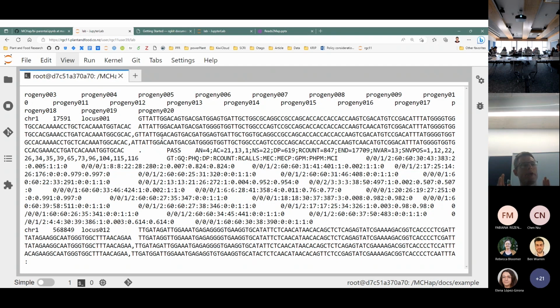With MC-Hap call, there is no posterior haplotype threshold option. So every haplotype that was input will be reported, which means with MC-Hap call, you'll never get a genotype call that has a missing allele. They will always be complete, which is one of the nice effects of the two-step approach as well.